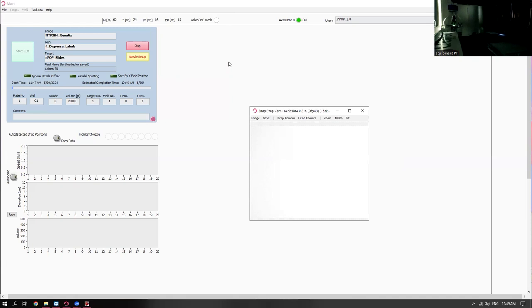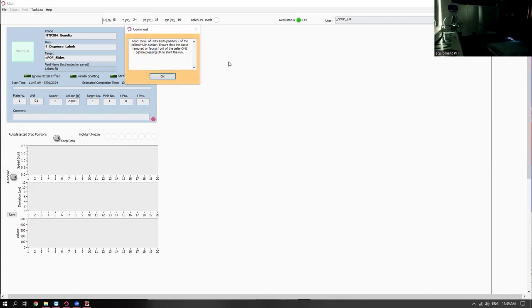There are times where you'll aspirate a big piece of air or something, and the droplets will end up being disturbed by this air that's hanging out of the orifice. It'll come back at the end of the dispensing to view the image, and you'll see this big bubble hanging out with the droplets all up. So you can go back and review the images that you took from before and now, and identify at what point things started to get funky.